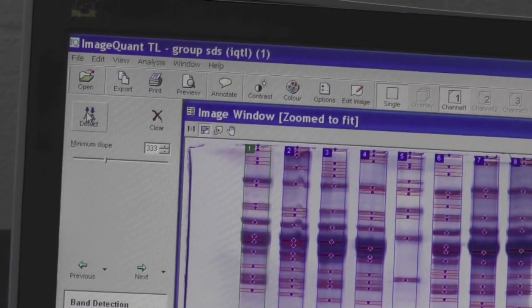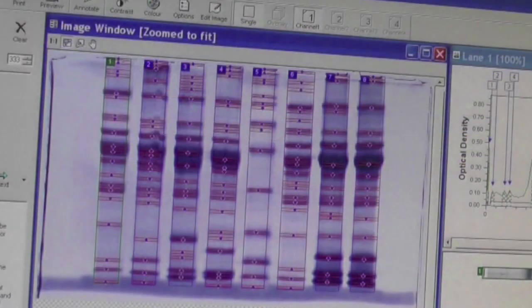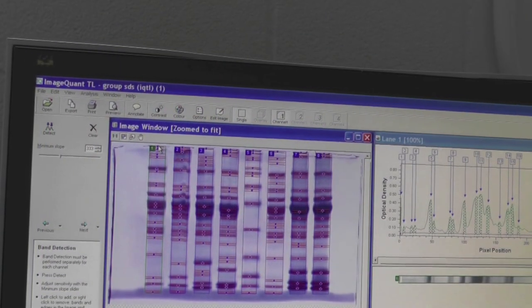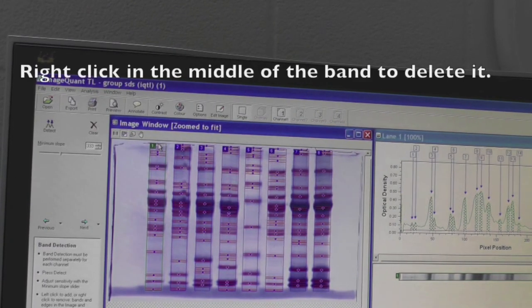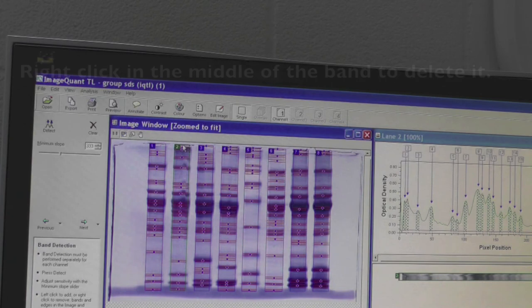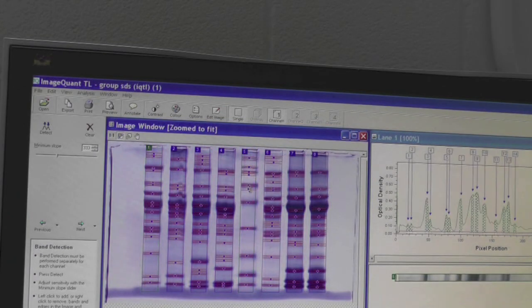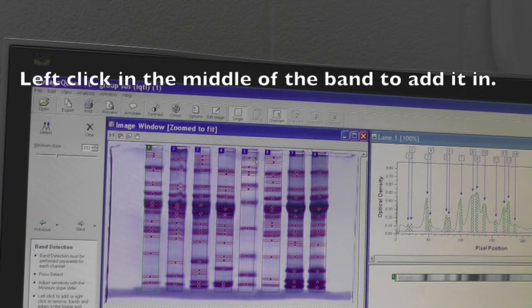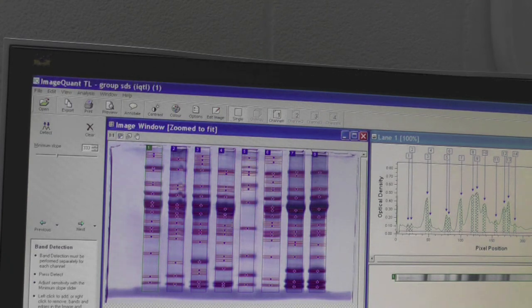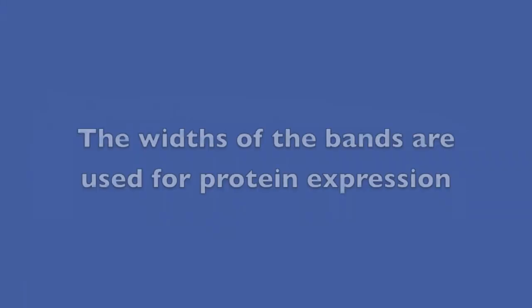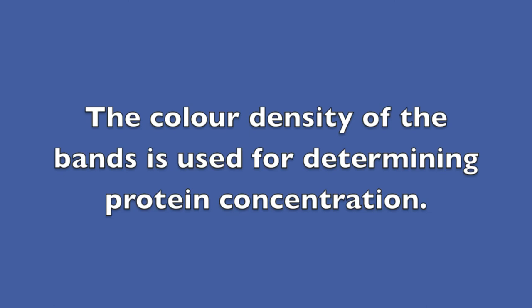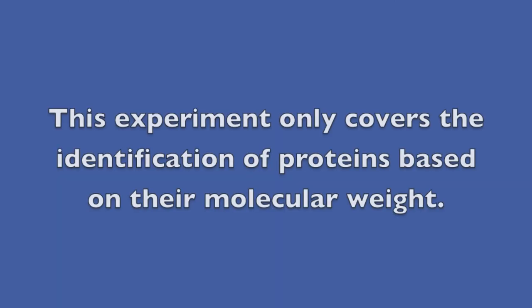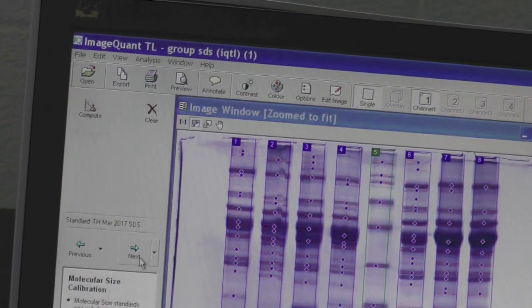Click on the Detect icon and all bands on your picture should be outlined. If there is a blank area mistakenly selected as a band, right click in the middle of the band to delete it. If there are any bands not detected automatically, left click in the middle of the band to add it in. You can also adjust the width of the bands, but it's not necessary for the purpose of this experiment. The width of the bands is used for protein expression analysis, where the color density of the bands is used to determine protein concentration. However, the objective of this experiment is to only identify the proteins based on their molecular weight. When you're finished selecting your bands, click on the Next button.